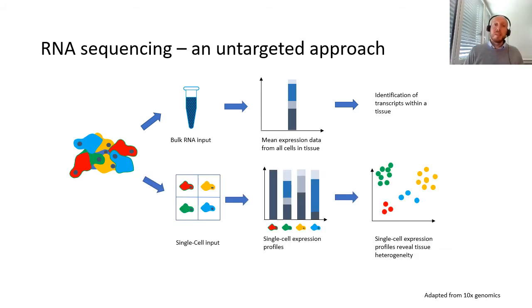And then single-cell technologies came along, such as Drop-seq or inDrop, that were fostering the single-cell revolution, because these technologies now allowed the barcoding of thousands of individual single cells. So now, instead of receiving tissue-scale information of the transcriptome, as we have just seen in bulk sequencing, it was now possible to obtain the transcriptomes of thousands of single cells at the same time, providing us information on the heterogeneity of transcription within tissues, which was, of course, a great next step.